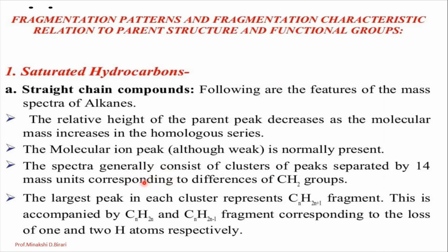Due to the cleavage of carbon-carbon single bonds, a number of fragments form, giving clusters of peaks, and each cluster is separated by 14 mass units corresponding to the difference of a CH2 group. So if you observe the spectra, it generally consists of clusters of peaks only due to the cleavage of carbon-carbon single bonds.